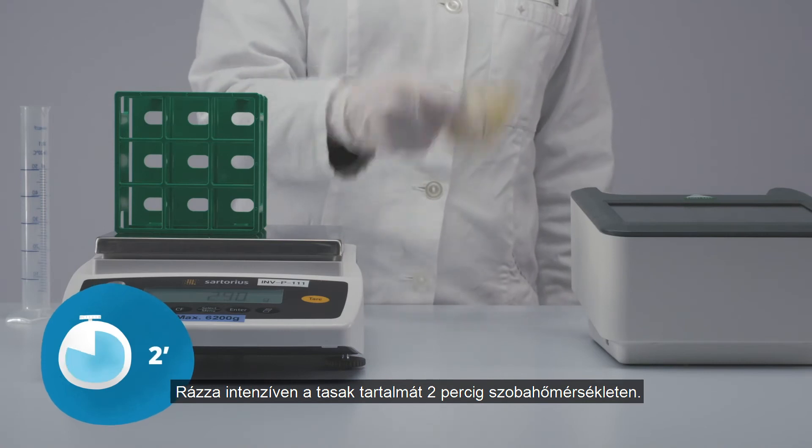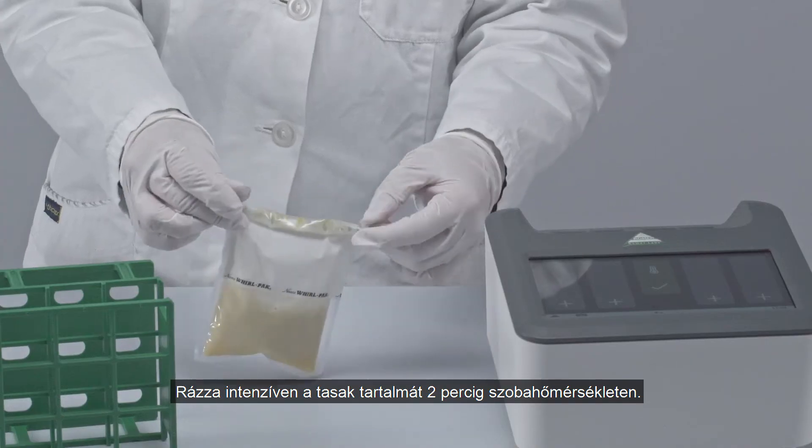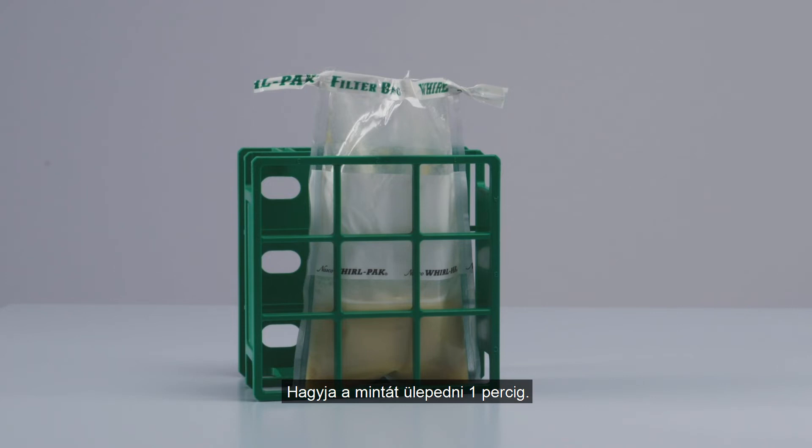Vigorously shake for 2 minutes at room temperature. Open the whorl pack filter bag and push the filter to the side containing the sample. Allow the sample to settle for 1 minute.